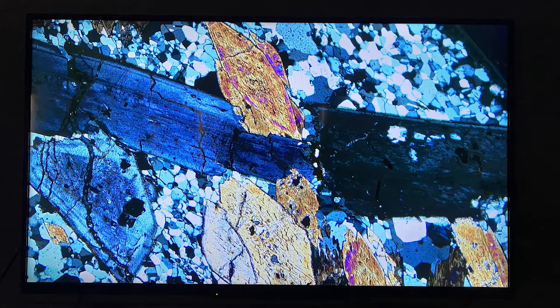Here I just inserted a clearer picture of this mineral under cross polarized light so that you can see the habit really clearly and the bright interference colors. I also think it's helpful to see all the minerals around glaucophane so that you can see the difference.